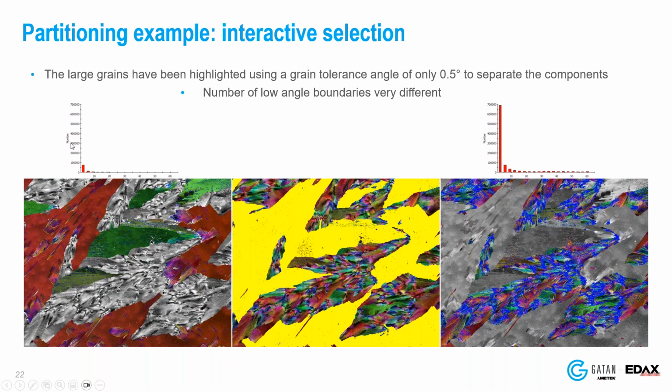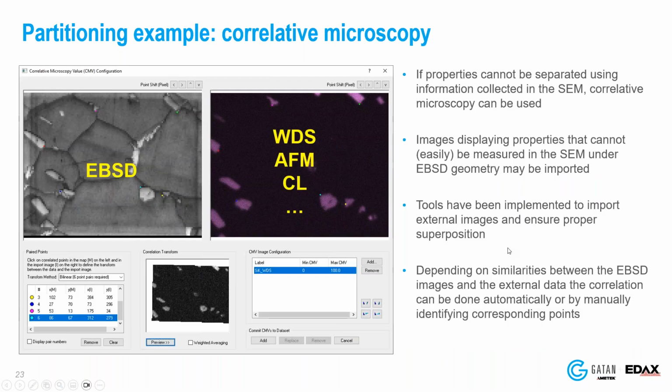But I can change that. I can also look at the fraction. And when I do that, you can see that the distribution is identical between the two. So there's not really a change from the small grain to a large grain fraction. It's just a continuous range over this entire material, small to large, and the distribution in the misorientations just evolves with it and doesn't really change with the size. That is based on data that I have in my map.